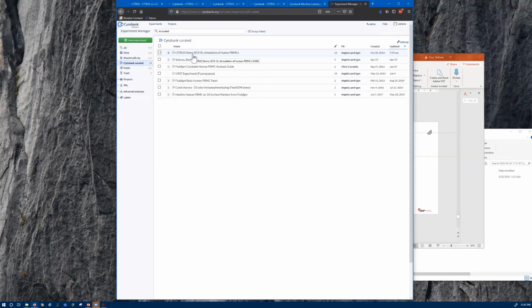From an anonymous attendee, how many samples per comparison group are needed to run the Citrus analysis? Sure, I'll be happy to take that question. For the algorithm, the minimum number of samples is 3. However, in order to have the statistical power, we recommend at least 8 samples per group to run Citrus so that the results are statistically solid. If you have too few samples, the result might be doubtful and not convincing. So 8 samples minimum to run Citrus.